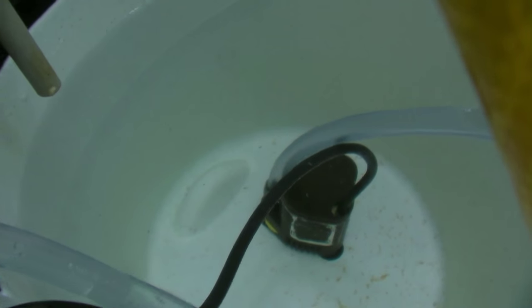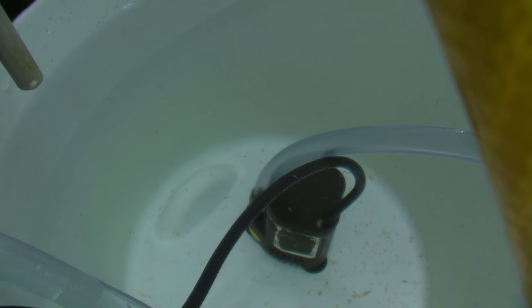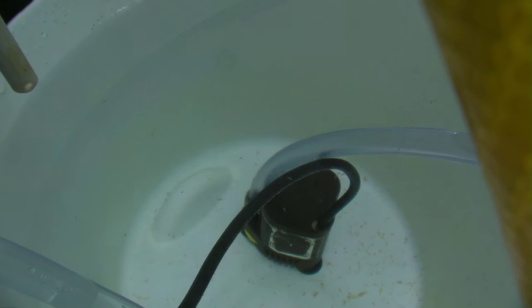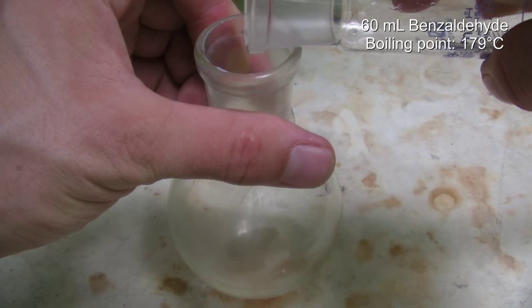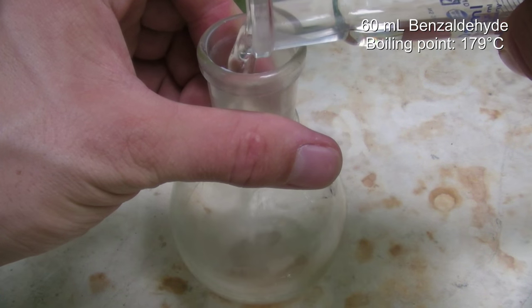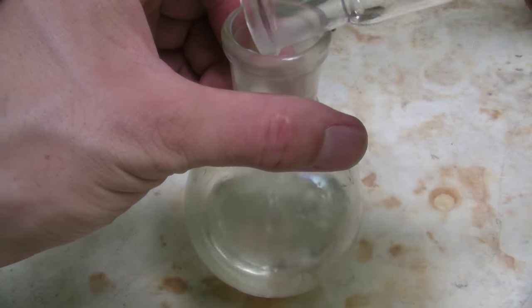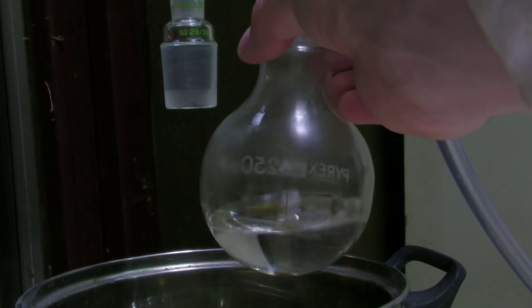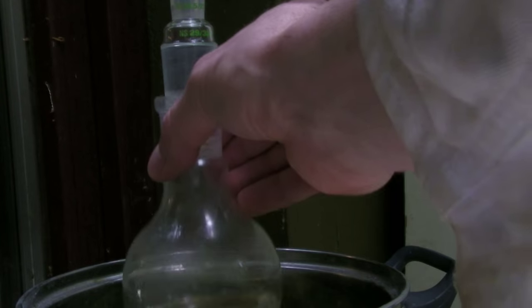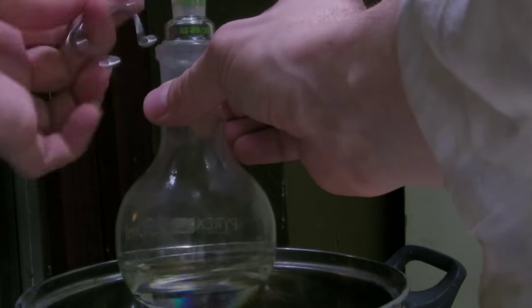The bucket contains a little water pump that will supply the condenser of the distillation bridge with water. To the distilling flask, 60 milliliters of benzaldehyde are added, which has a boiling point of 179 degrees C. All joints have to be greased very well, otherwise the pressure could be not as low as possible.